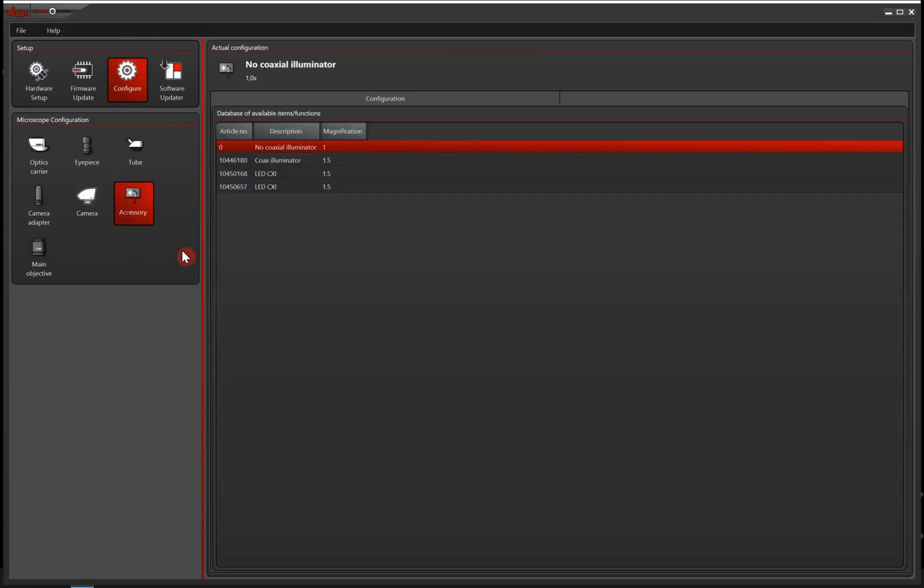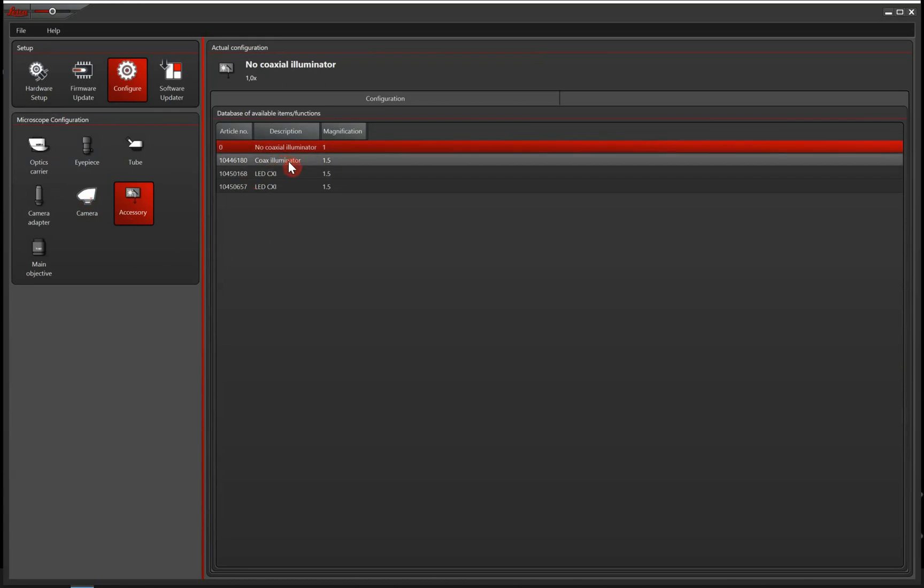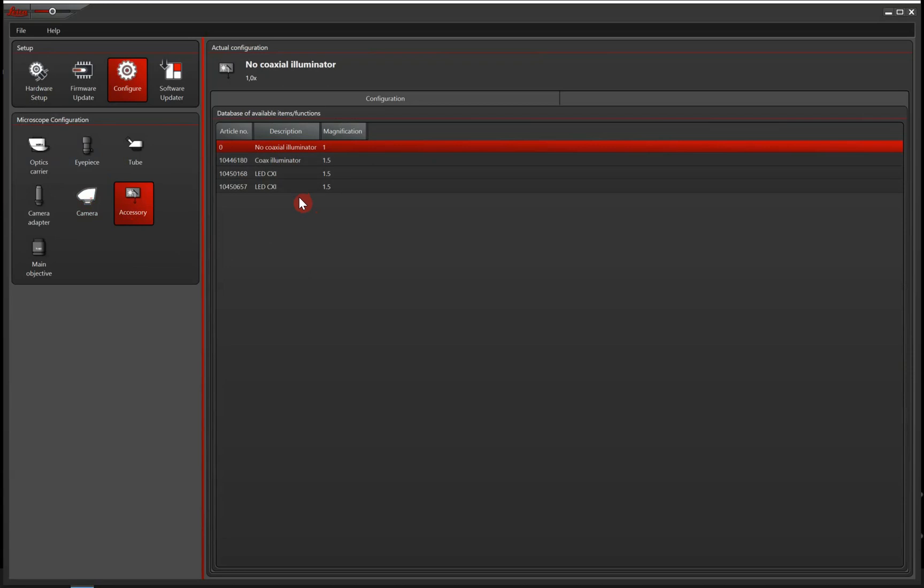And next up is accessory. And accessory is if you have a coaxial illuminator. A coaxial illuminator is an illuminator that goes through the optics carrier and through the objective vertically.